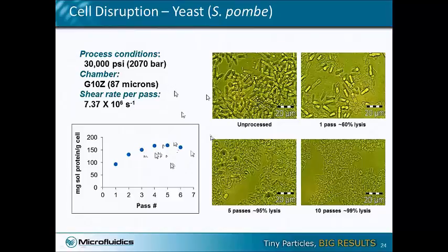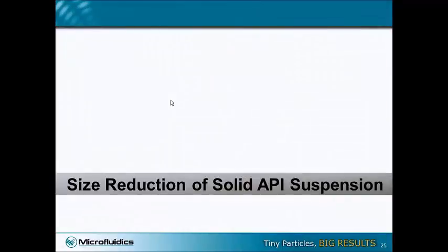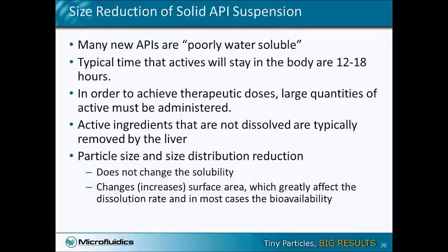Now let's move on to size reduction of solid suspensions. As I mentioned before, most newly developed APIs are water insoluble, with very low solubility in water.